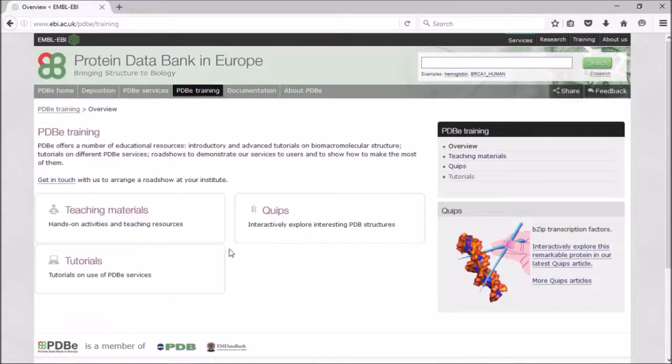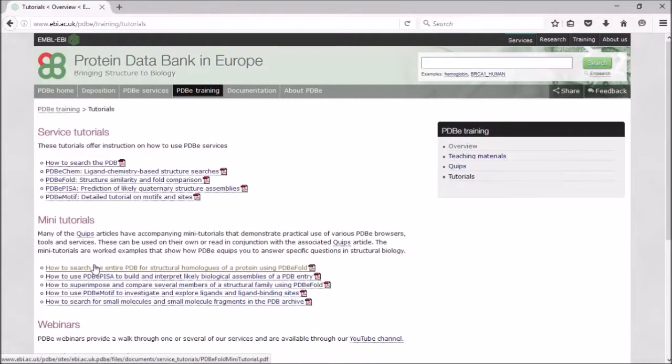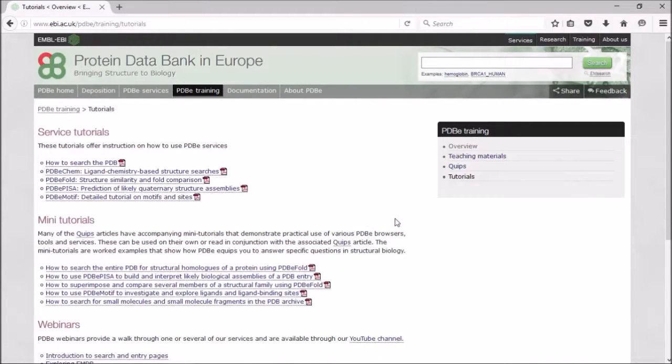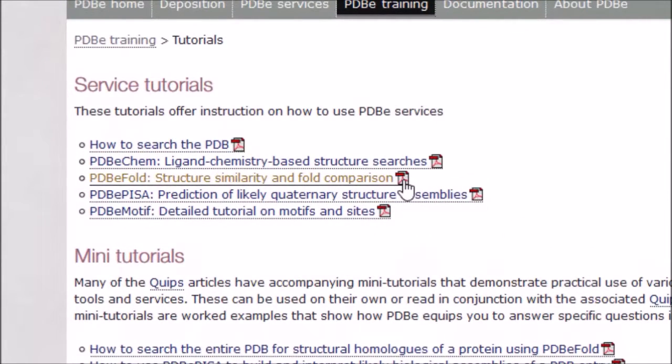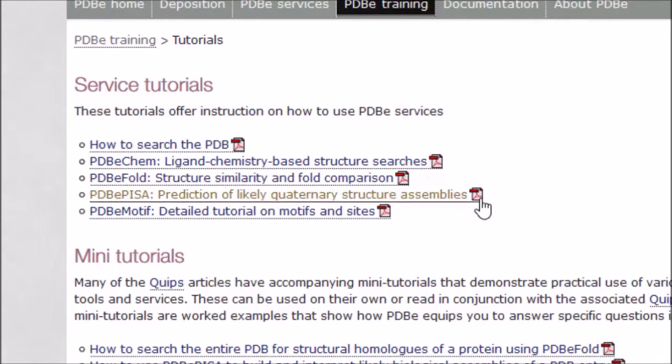If you go to our training tab and click on tutorials, we have a number of tutorials here, and you will find our webinar here once it's been finished. There's a link here for PDBe Fold, and there's also a link for PDBe PISA, and these are tutorials to help you find out how to use these services.